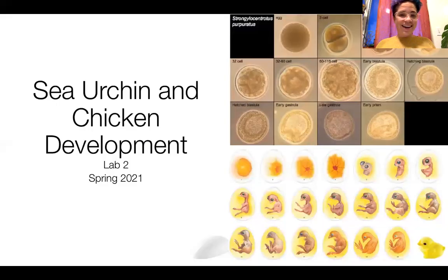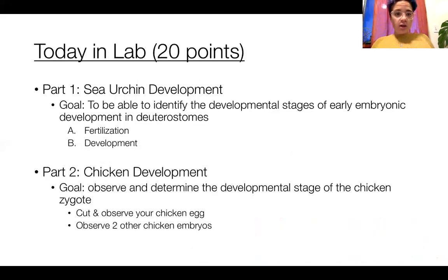Okay, hi. Today I'm going to be giving you all a quick intro to the Animal Development Lab. Just as a quick reminder, you should have read the lab packet. We are working with sea urchins and chickens. A brief overview of some of the goals that we're trying to accomplish today.